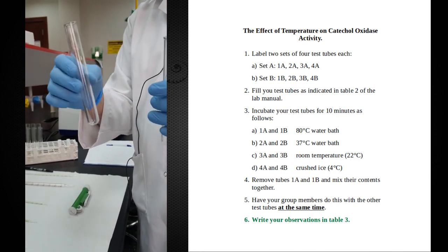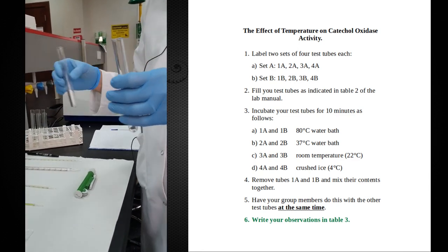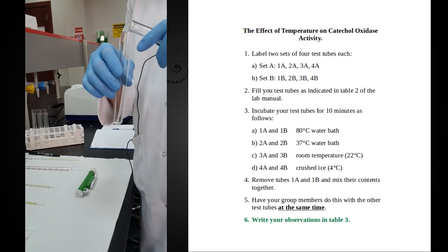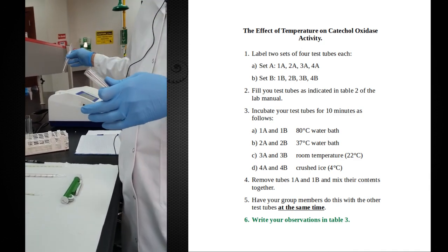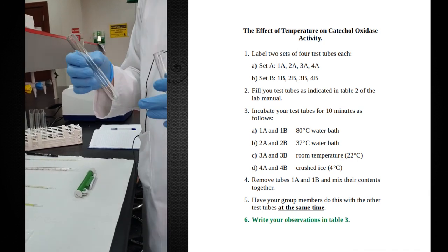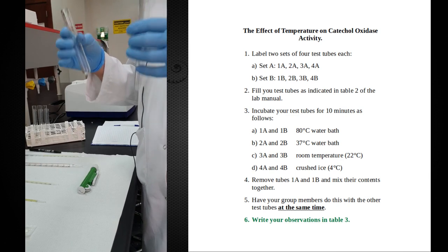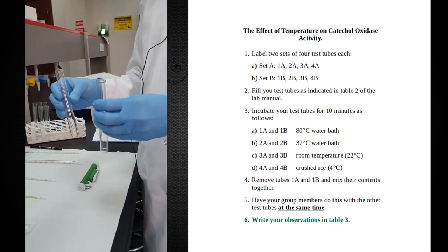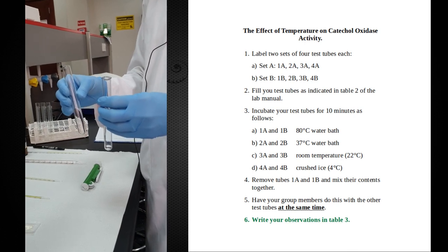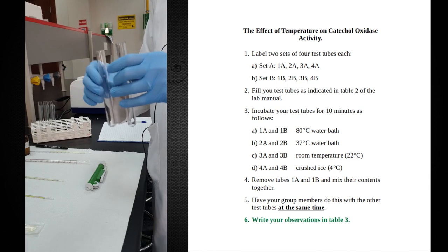If we had put the substrate and enzyme together and then placed them at the appropriate temperature, the reaction would start the moment we transfer the two components together. By the time the temperature reached the right level, there would have already been some reaction happening. So to ensure the reaction happens exactly at the temperature we specify, we first incubate the components individually at that temperature, and then once they have come to the right temperature, we combine them together and look at the final results.